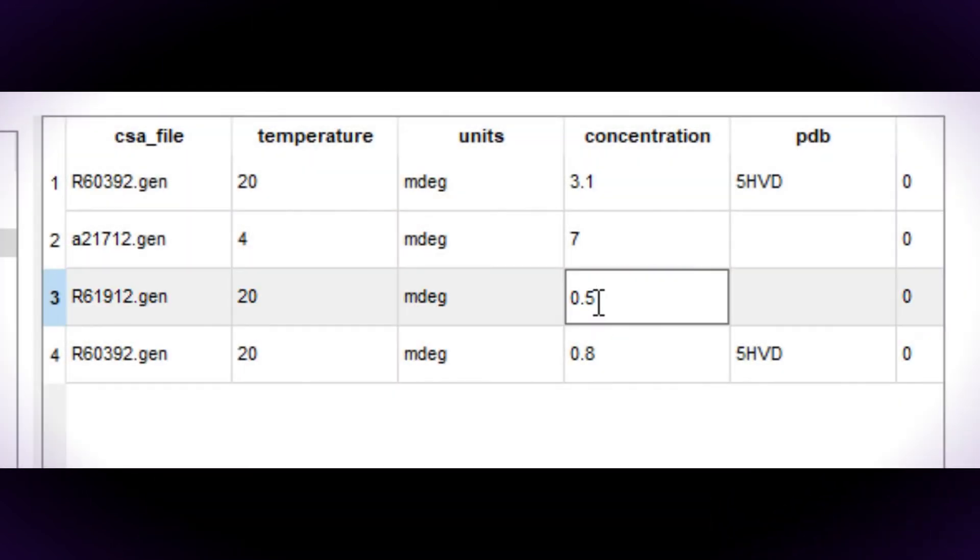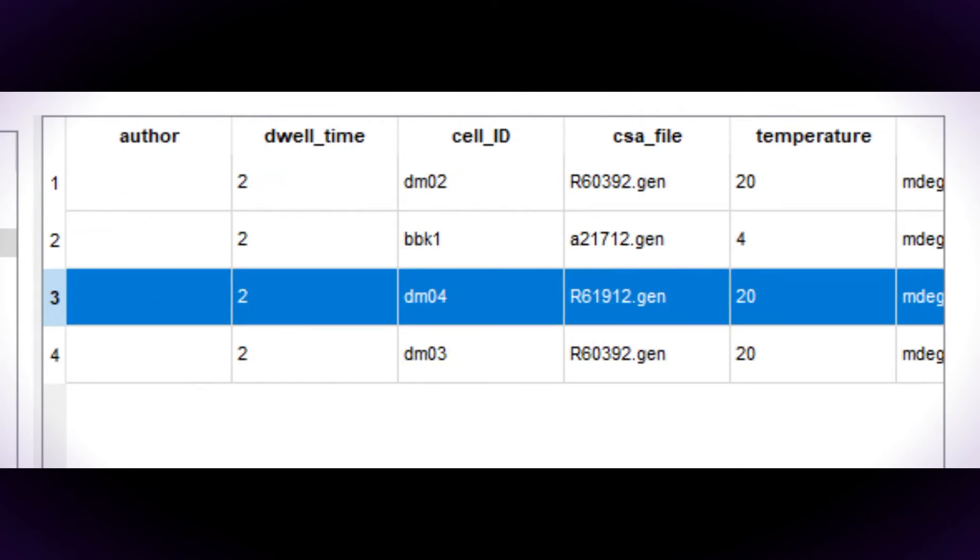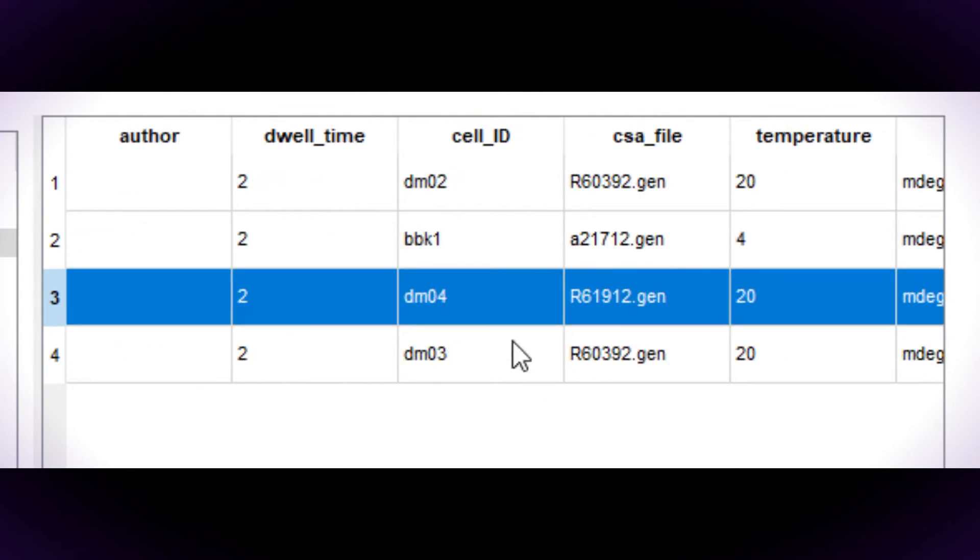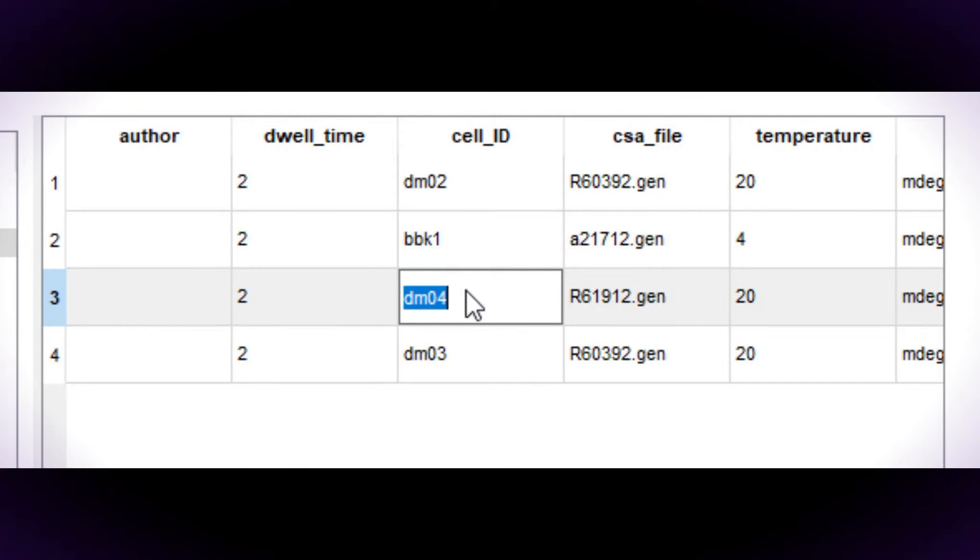There is a field for the concentration in milligrams per milliliter in the generic table. The cell path length is entered in the cells table and the cell is given a code which is entered in the cell ID field for the generic table.